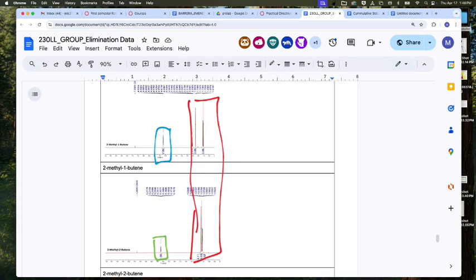So we're using NMR differently than we did in our spectroscopy assignment, because in the spectroscopy assignment, you had to determine what your structure was. We're not doing that. You're looking at literature saying that's what the structure is. Does your compound show that signal? Okay? So we could go in and zoom in on what those are. For that 1-butene, the top, we're looking at about 4.75. And for the 2-butene, we're looking at 5.2. Almost exactly like the NMR spectra zoom-ins that we saw before.